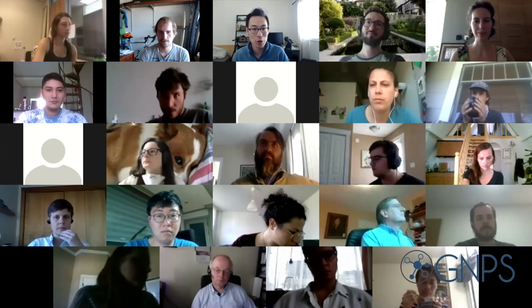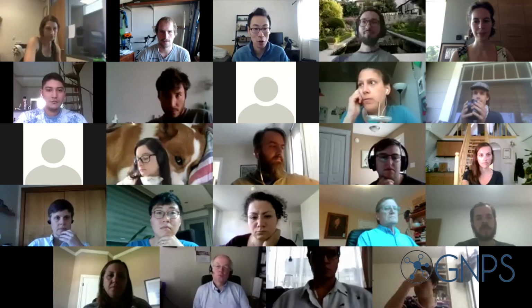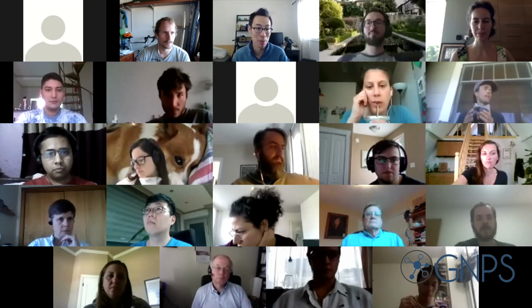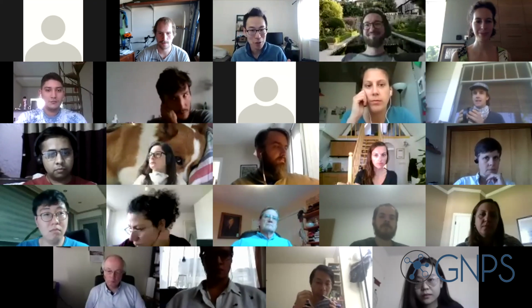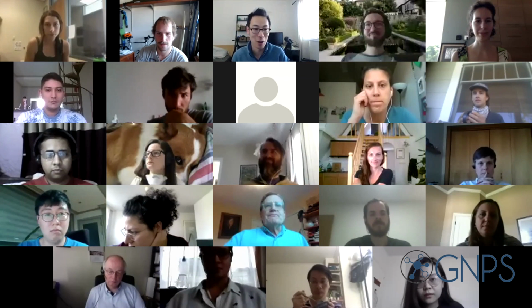We want to show you today how to use it and how it integrates with feature-based molecular networking in GNPS. Hopefully it'll be seamless and interesting to use, as well as really cool visualizations that Robin put together. Without further ado, I'll hand it over to Danny, Robin, and Allegra to show you how it all works.